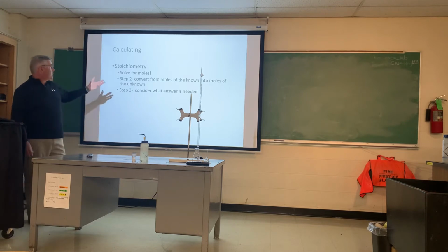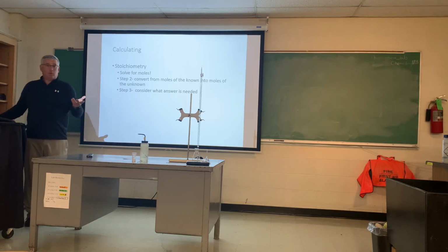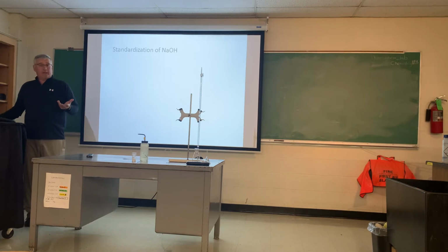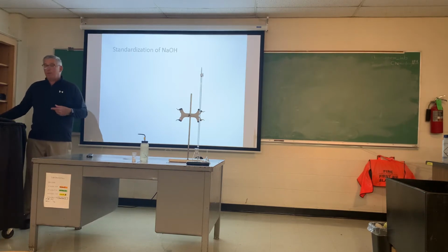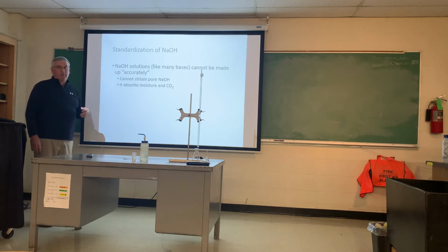All right, don't forget stoichiometry. We're going to solve for moles again, right? And so we're going to use the titration as the physical part of the lab to set up calculations in stoichiometry. And so remember our three steps. We're going from something that's known, whether it be concentration or mass, to moles, and moles of A to moles of B, and then moles of B to our final answer. And so we're going to actually end up in a different place with this lab than we've been doing in class. But the beginning of this, the first part again, is the standardization of the sodium hydroxide.